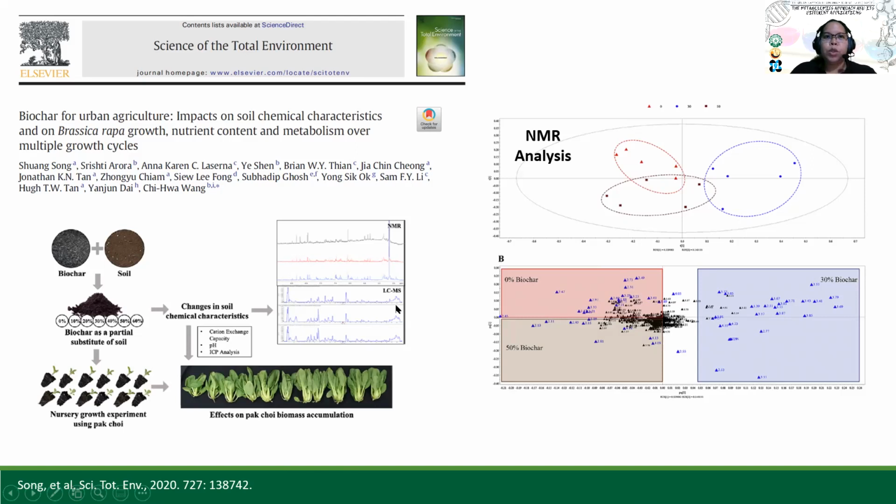In LCMS, we made use of a high resolution QTOF LCMS system that is capable of tandem MS also. But this is mainly showing you the TOF MS scan that is produced. We made use of both positive and negative ionization. So again, details of these experimental considerations and parameters we will cover in the next session, which will be next week.